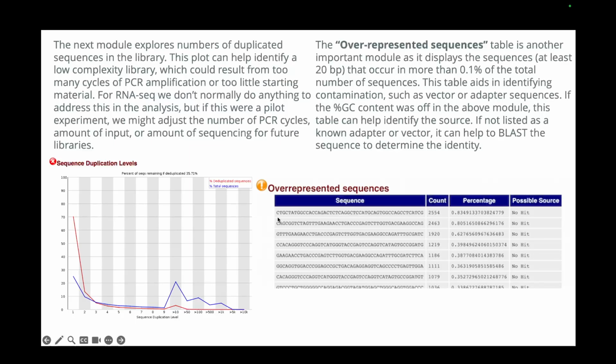Take, for example, this sequence. It appears in your reads 2500 times. Basically, you have too many times that this particular read is coming out. If this is not from a repeat region, it means you have a huge duplication in this region, which is normally not the case, because if you had something like that, you would know. As a person, you would either develop some sort of disease or a different type of phenotype. It will not be normal.